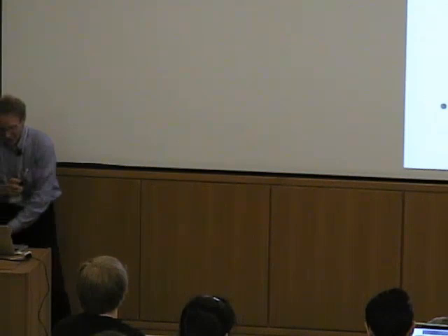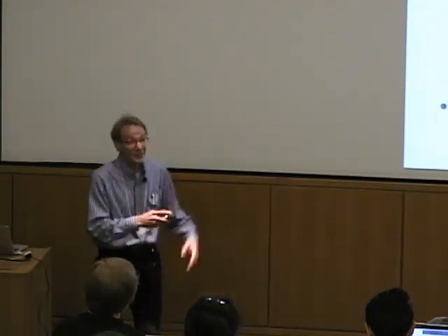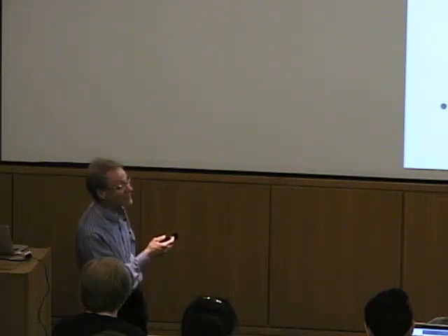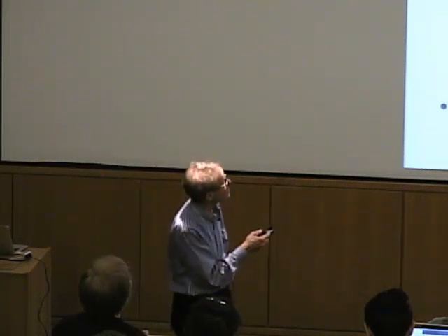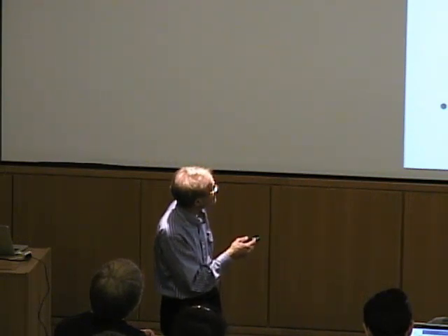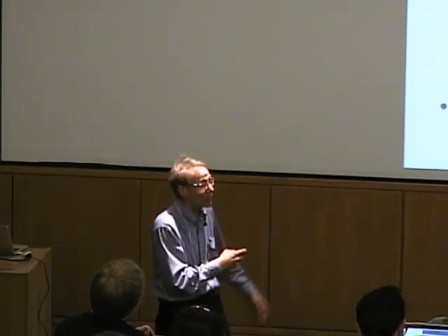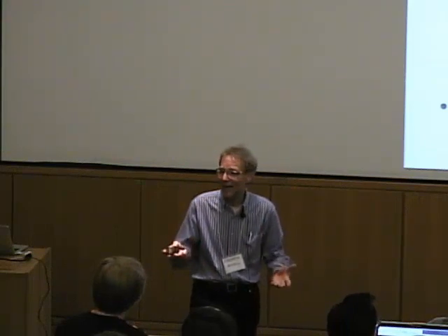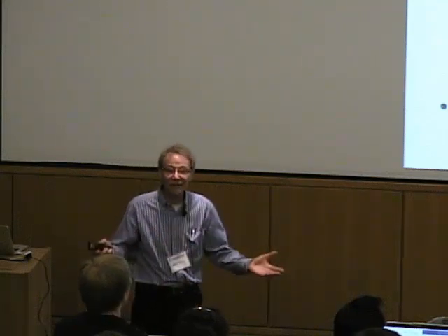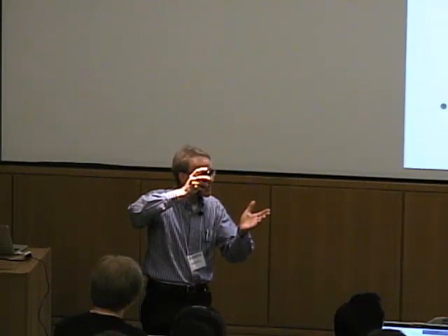Now, it turns out this has been measured for a long time by many different methods, so let's look at the stability constant, the equilibrium constant associated with that. At pH 7.4, the log K by all these different methods is somewhere around 10 to the 12th, 10 to the 13th. That's femtomolar? I mean, that's really high affinity. There are a few outliers there. How are we going to fit that if your C window kind of stops at 10 to the 8th?